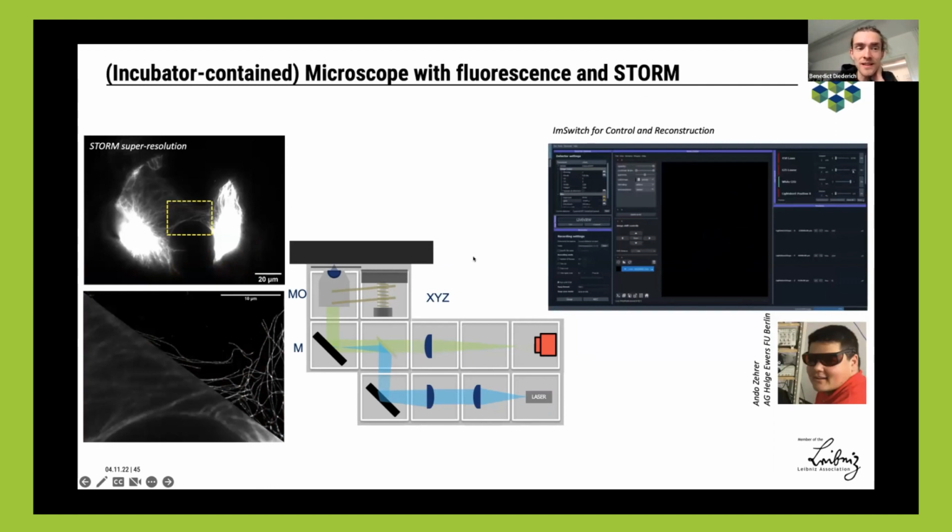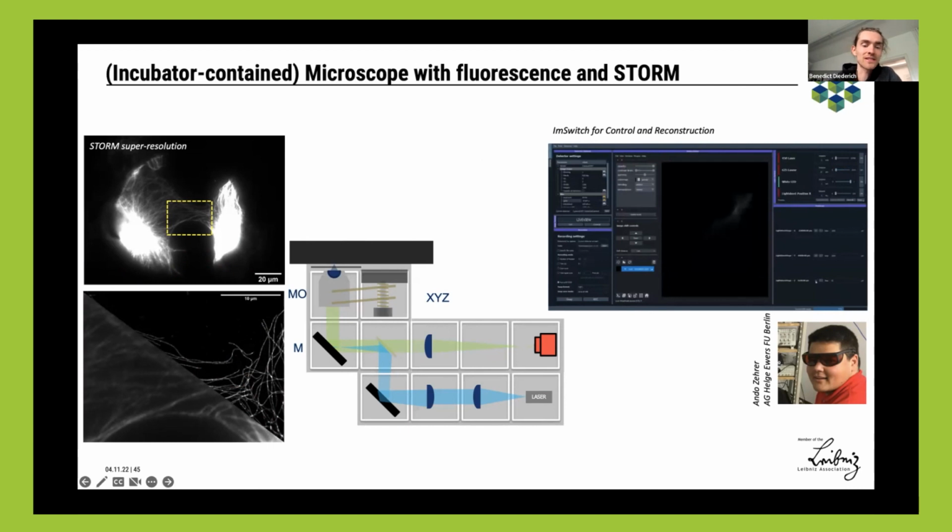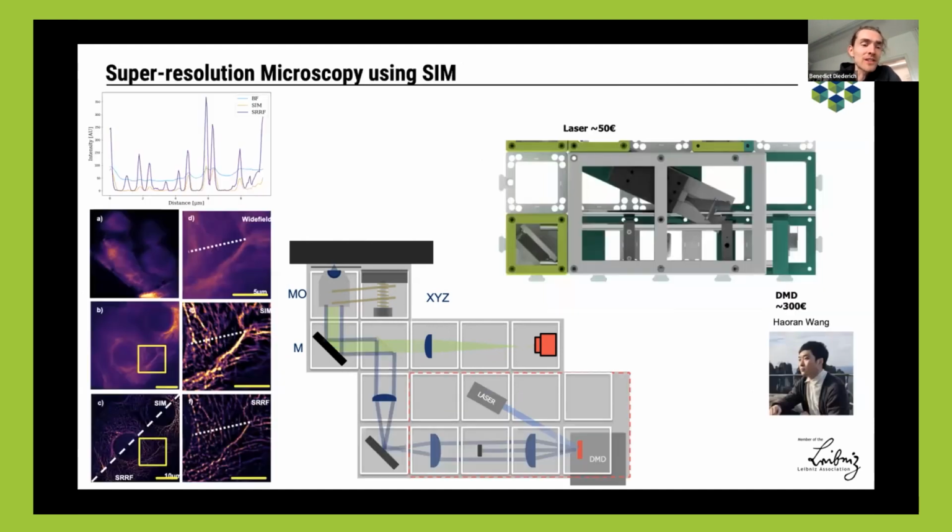And the cool thing is, since it's open source, I can just openly talk about it. And there are many people really interested in collaborating. So you learn on both ends. Those who build learn how to build, and I learn what's the process in the end, how to get the biology right. And then we also tried to do some stuff regarding structured illumination microscopy.